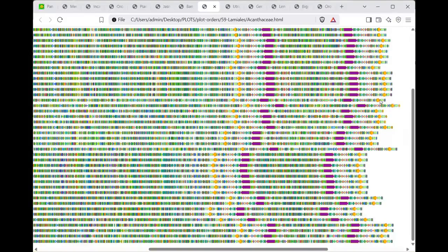Let me click another one, a small green one. Okay, so I clicked a few segments of the inverted repeat, which also help you determine the short single copy region and long single copy regions, the entire segment there. And you can see that the entire family has the inverted repeat well conserved because you can highlight them all together. So that's also an indication that these plants are grouped together in the same family correctly.